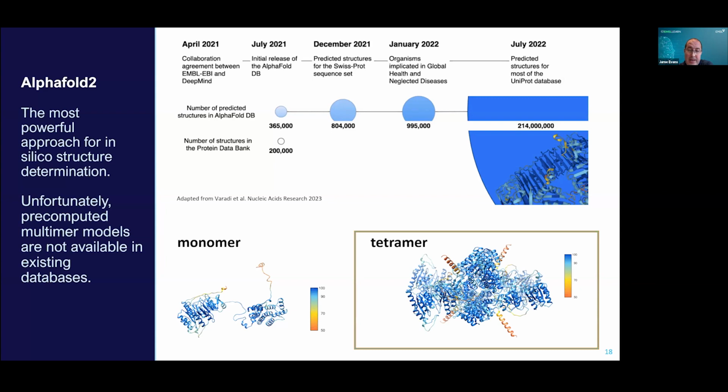And we intentionally, with every single sample that we wind up putting through the 1,000 fungal proteins pipeline, do a screen with AlphaFold for potential oligomerization with multimer models of monomer, dimer, and everything up to about 12-mer, depending on the overall sequence of your target protein. And we use this to inform our experimental studies.